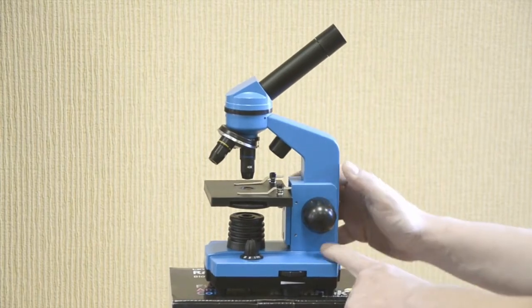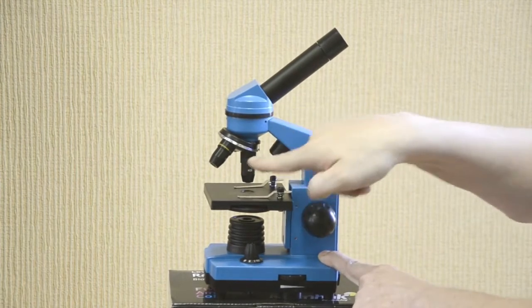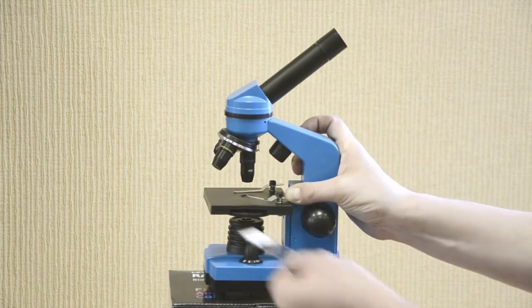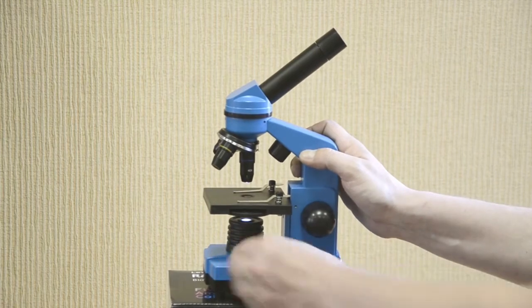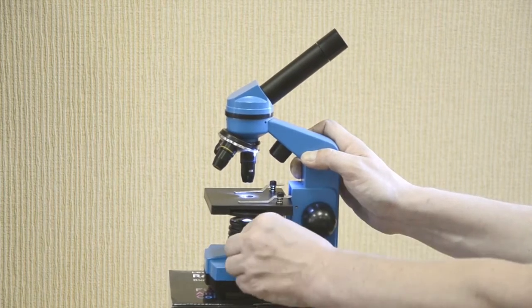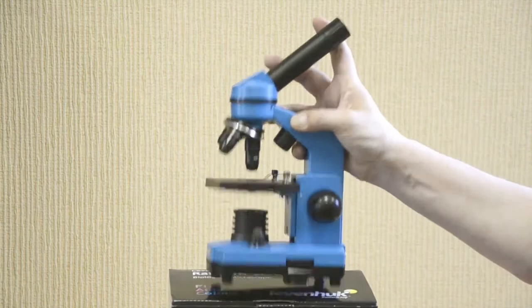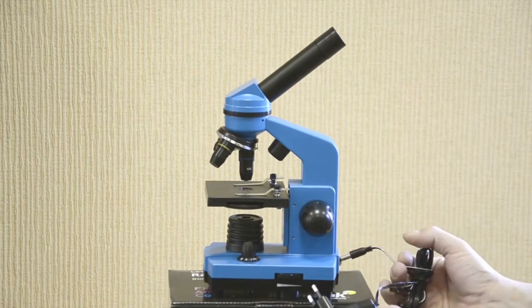The microscope features a monocular head inclined at a 45 degree angle, a 10X eyepiece, a revolving nose piece with 3 objectives, a focusing knob, slide holders, a lower light source, an upper light source, and combined illumination with adjustable brightness. Here's the diaphragm disc. The device can be powered by 3 AA batteries or by an electrical outlet, and you will find a 110V or 220V AC adapter in the kit.